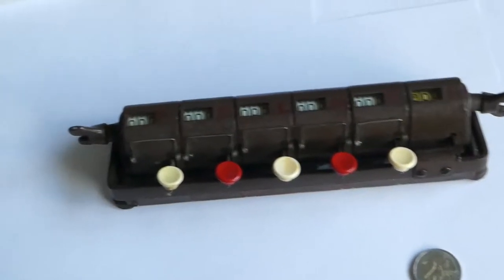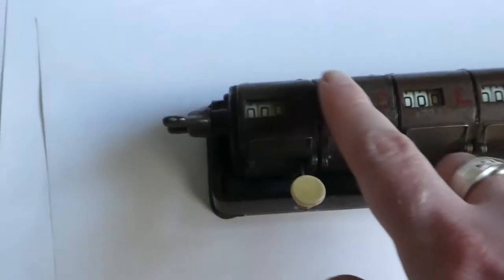This is a lab counter. It contains five independent counters.